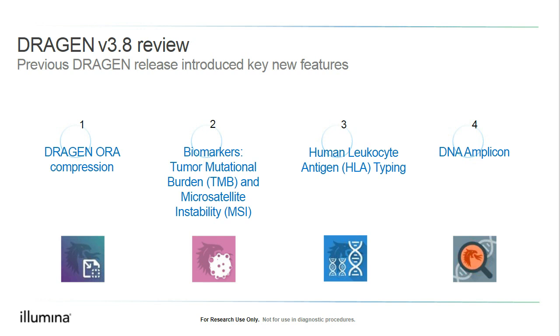And then we had also introduced the DNA amplicon feature in 3.8. So again, that's a feature that has been getting some traction, and we have an app as well in BaseSpace that lets customers run their amplicon sample.